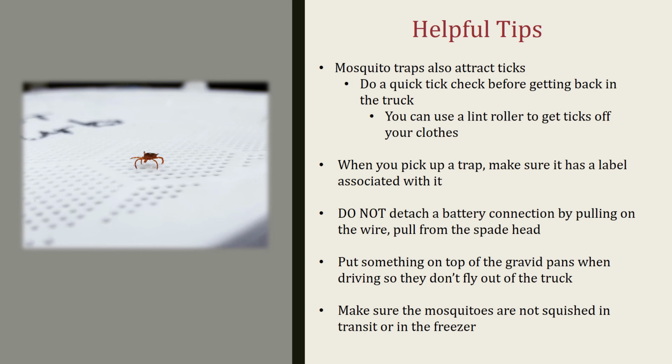And you can put something on top of the Gravid pans when driving so they don't fly out of the truck. And make sure the mosquitoes are not squished in transit or in the freezer.